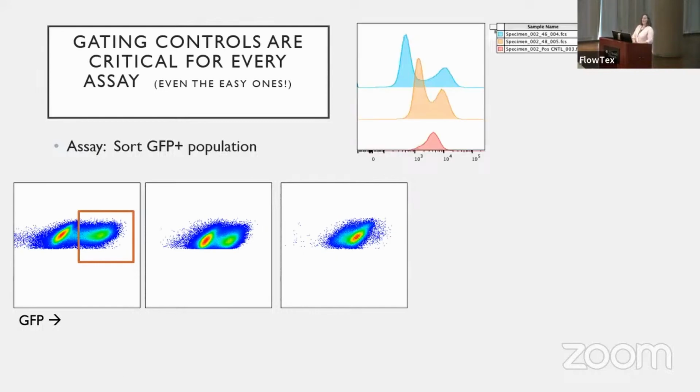So the proper control, I can already see you guys. Well, if you just line them up, we can be able to see this a little bit better, right? And indeed, these all look kind of positive, but they're not quite as positive as this positive, and that's my positive control. So I don't know if these are negative. We'll see. So I did bring in a control. Does this change your mind about any of the gates?